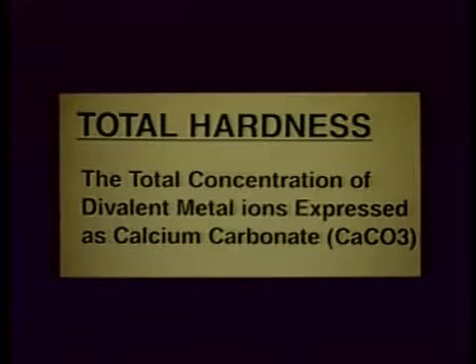Total hardness refers to the total concentration of divalent metal ions expressed as calcium carbonate. In most waters, calcium and magnesium are the principal ions which make up total hardness.